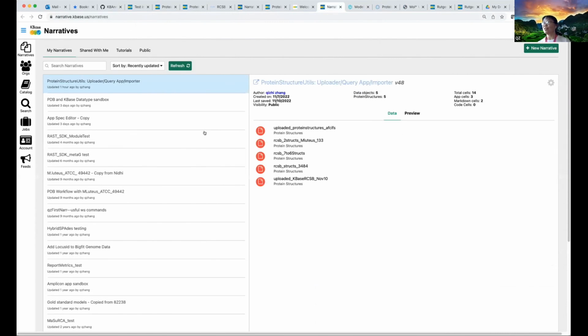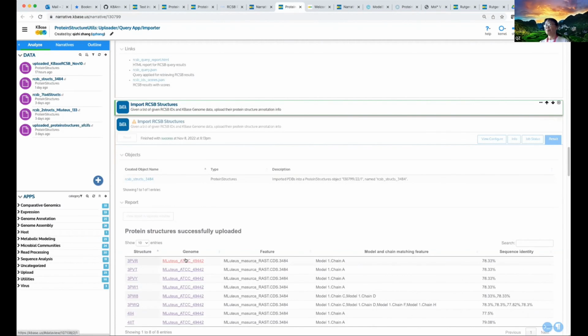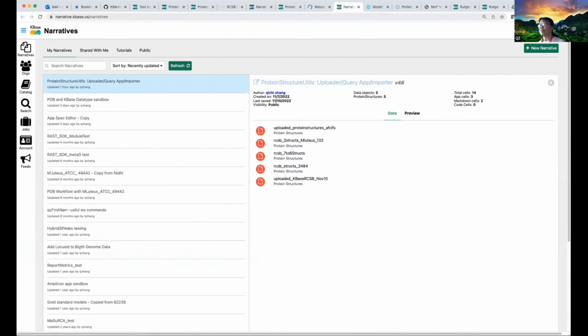So you didn't sign in, and KBase will welcome you. After you sign in, it's not shown.